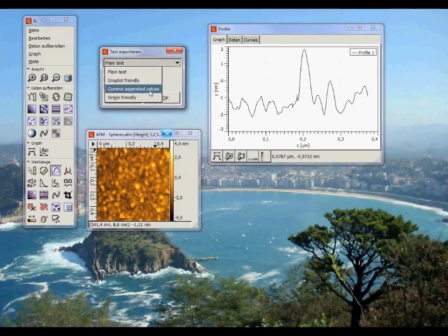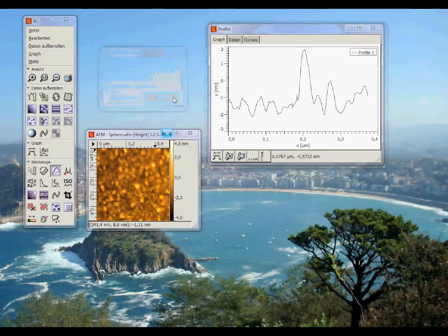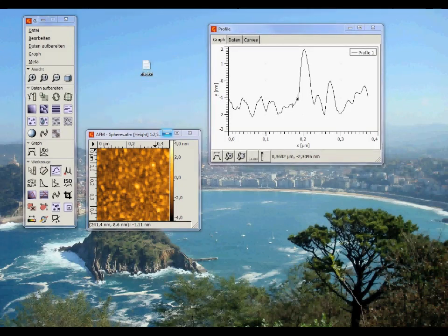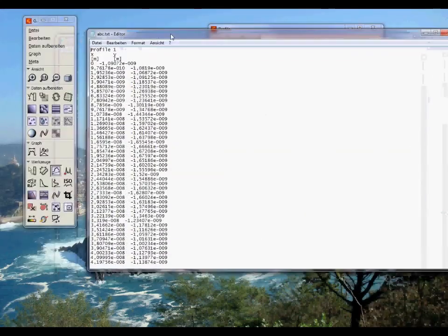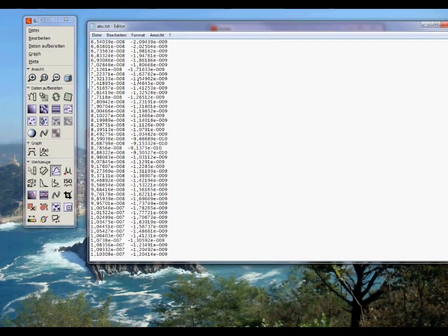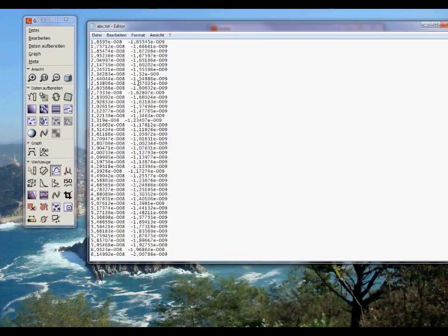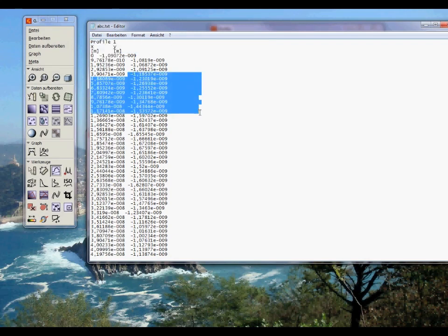If you select plain text or origin friendly, your exported file will look like this with your X and Y values. This format is quite strange, however, since you have all the strange spaces here and in between the values.